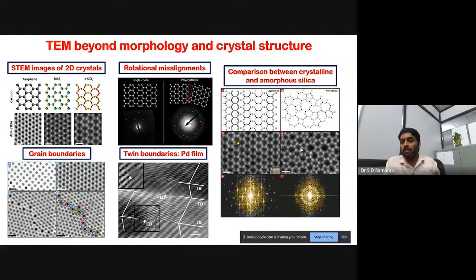Because the glass plate is amorphous, you will end up with an amorphous nature in the powder XRD. So presenting only the powder XRD is not sufficient if you want to publish your paper in high quality journals. In support of that, if you include TEM images showing that they are amorphous in nature, that can also be reflected in the diffraction.